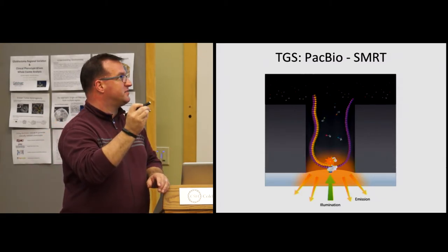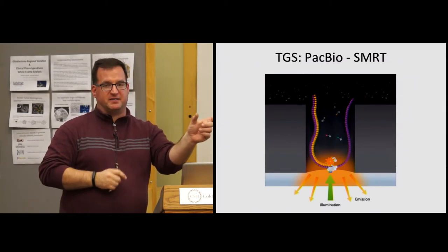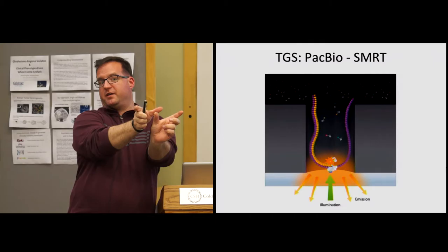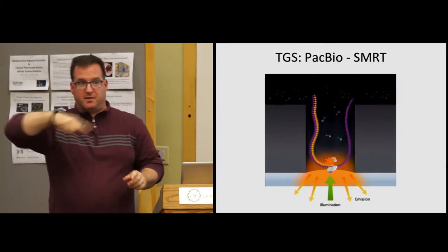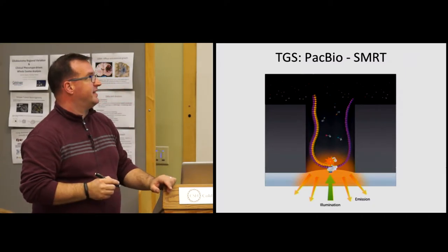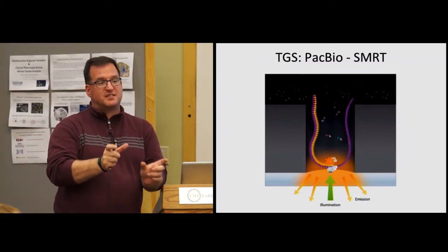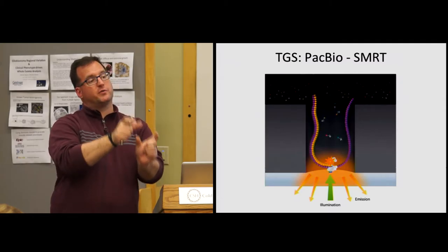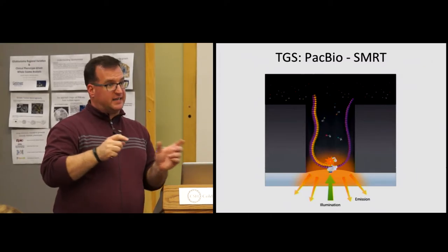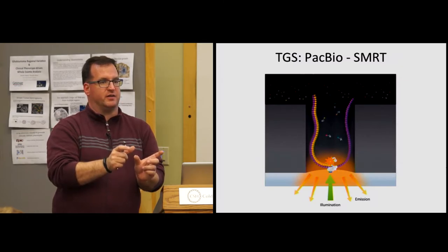And if they actually have circular templates, then the circular template can go around and around multiple times. So you get 10 bases here, 10 bases here, 10 bases here. But then the next time it comes around, maybe you're offset by another 3 or 4 bases. Now you get 10 bases, 10 bases, 10 bases. And you do that multiple times, and now all of a sudden you have a pretty complete sequence. So strobe sequencing is the fancy thing that you can do with the PacBio to get very long reads. And again, just like, remember in SOLiD, I said one of the great things about the error rates was that you were reading the same sequence multiple times. With strobe sequencing, particularly on circular templates, you can get that same effect where at least for some of the bases, you will have actually tried to get a call on them multiple times.